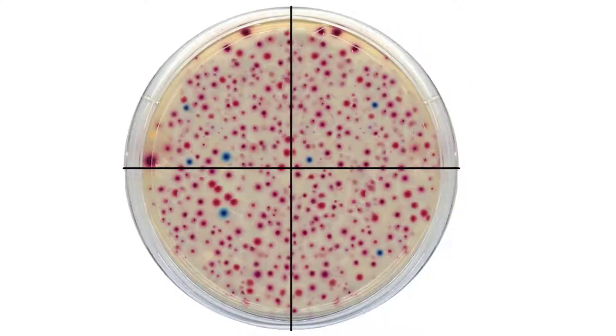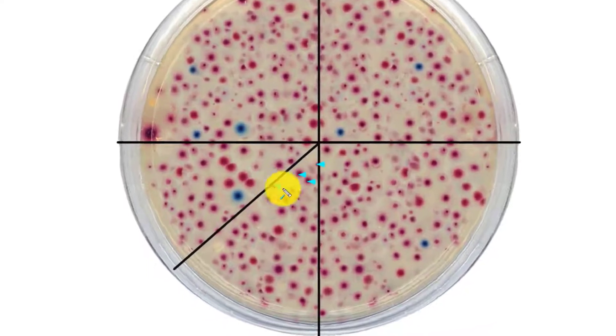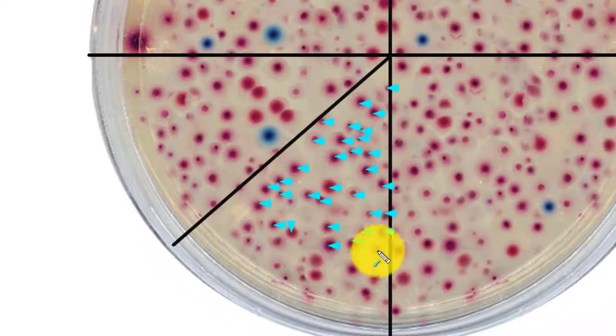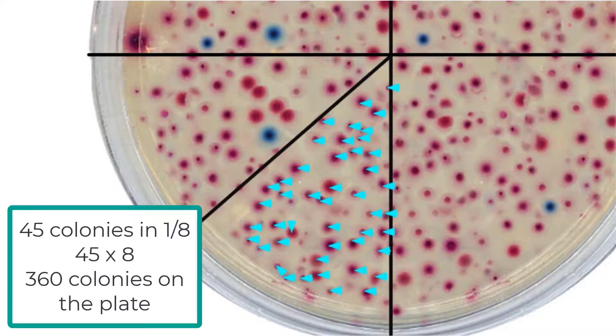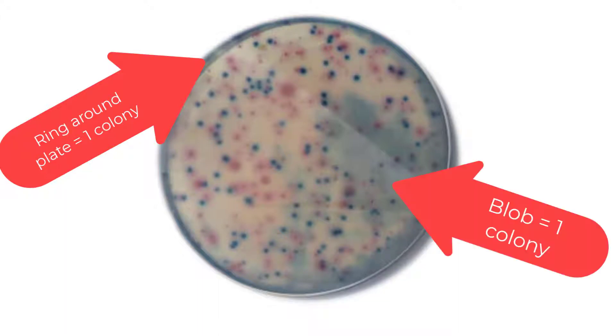If bacteria colonies are too dense, it is possible to estimate the number of colonies by counting a one-fourth or one-eighth section of the plate and then multiplying the number of colonies per that section by four or eight respectively to get a total CFU estimate, or colony forming unit estimate, for that plate. If the colonies appear as a ring around the edge of the plate or as one large blob, count this as one colony.